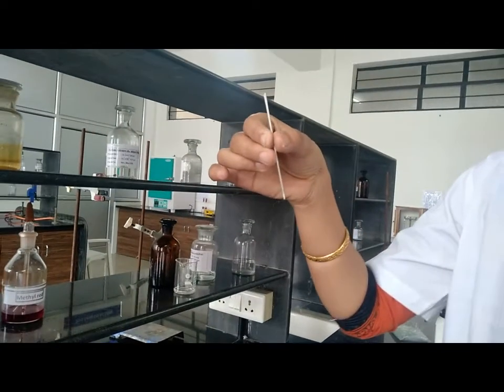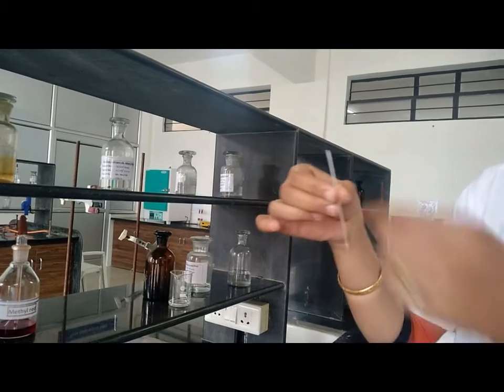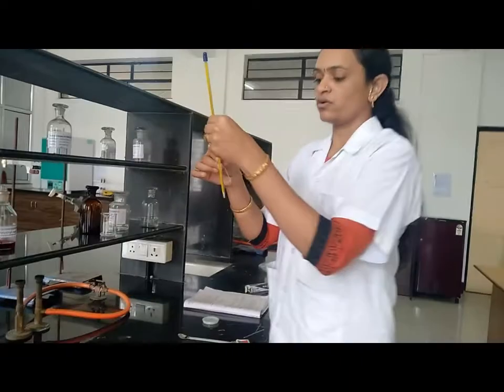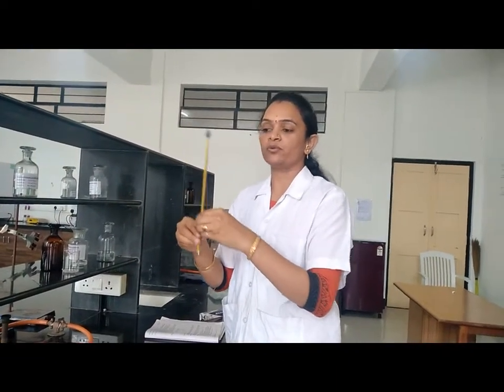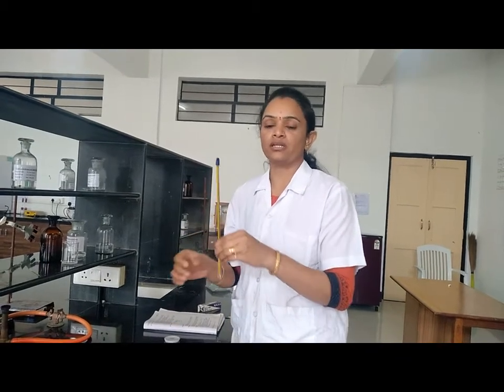Like this, only 3 to 5 milligram of sample we have to insert into the capillary tube. After inserting, tie this capillary to the thermometer with the help of thread, and then put it into the Thiele tube containing liquid paraffin.